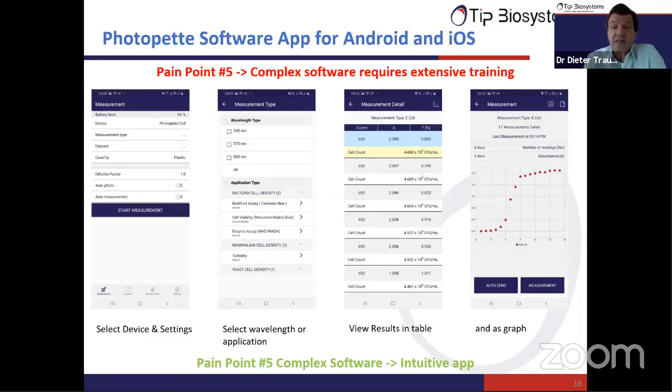And this is very handy because we have 2 different ways you can display your data. The table view here, but we also have the graphical view. If you in the app click on this little graph icon, then it will switch to graphical view. And in this case, you directly see your growth curve of the E. coli cells.